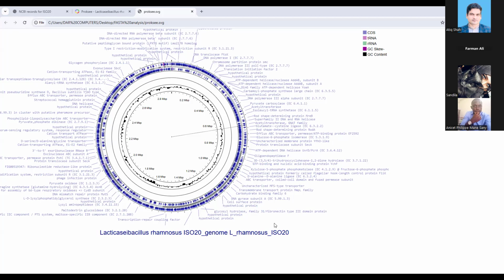Please all participants open R Studio and type done within the Zoom chat. I have done, so I'm going to type done.